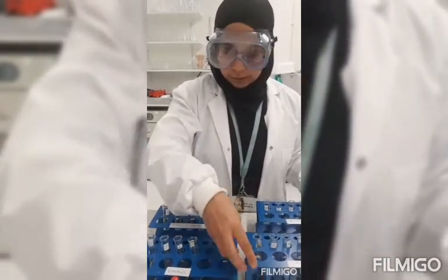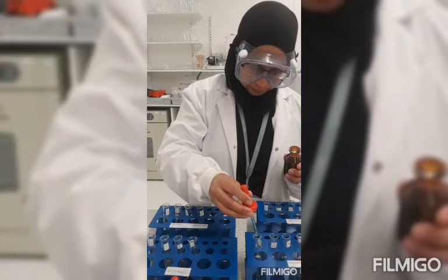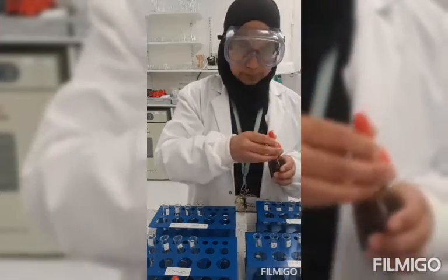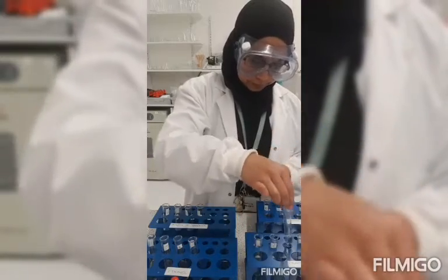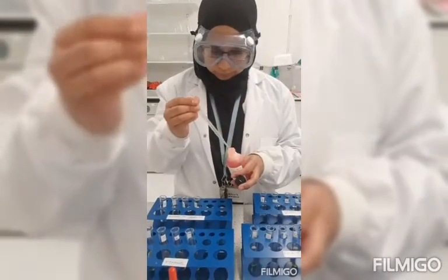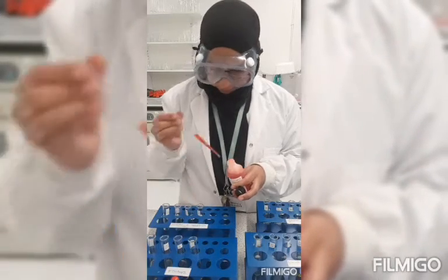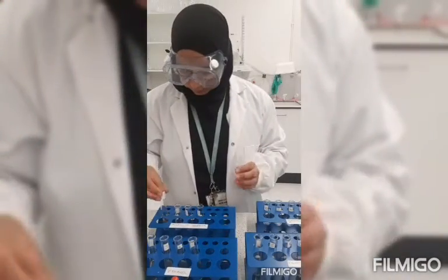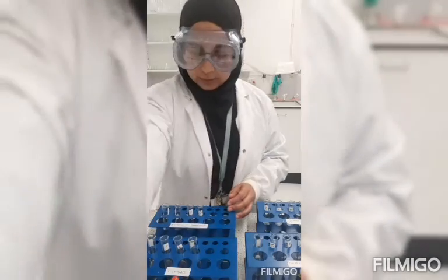And then I'll go on to my biuret solution — again a few drops in each one. Then I'll go on to my Sudan III solution — give it a few drops in each one, give it a swirl. And finally my ethanol — a few drops in each one.